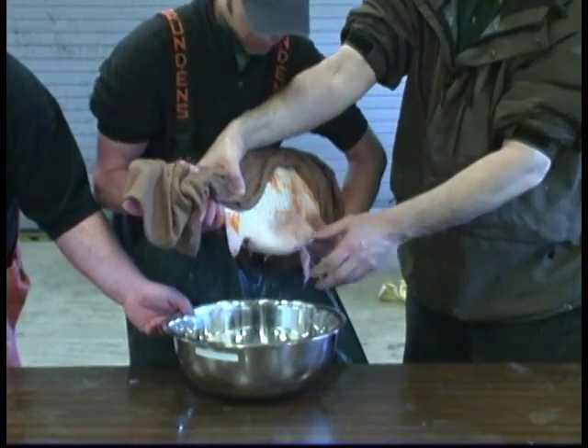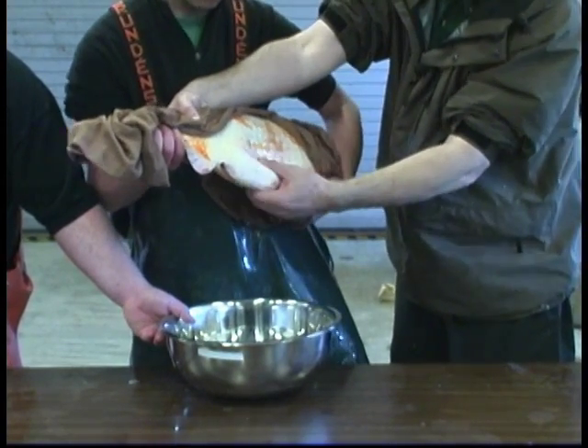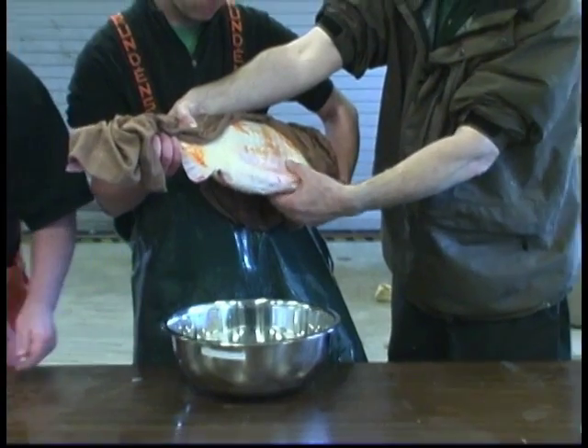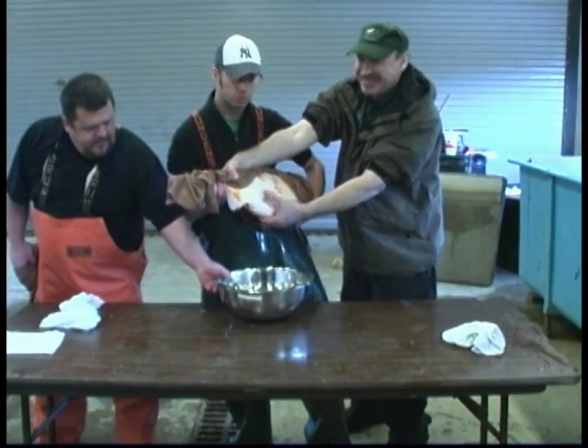Now we have a sign of blood — that's it. You can see here a large female; you can see she is empty, nothing left. Instead of a big belly, the abdomen is now flat.